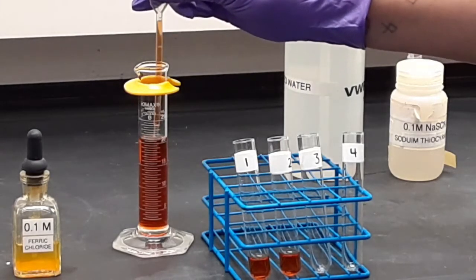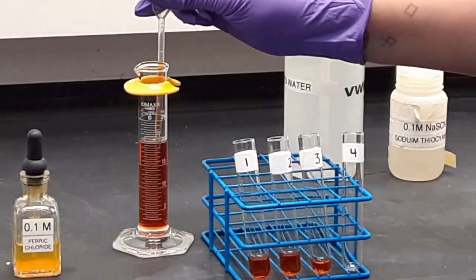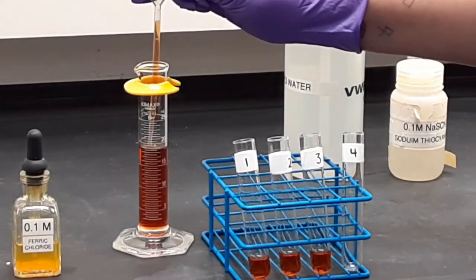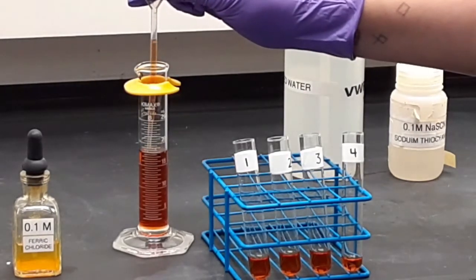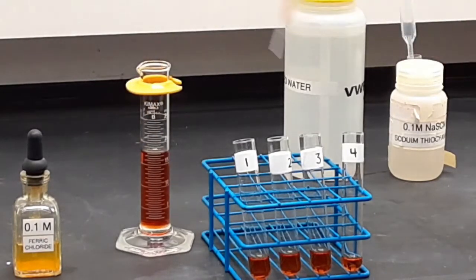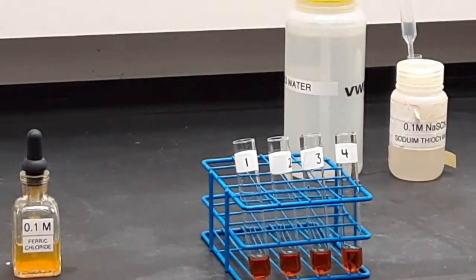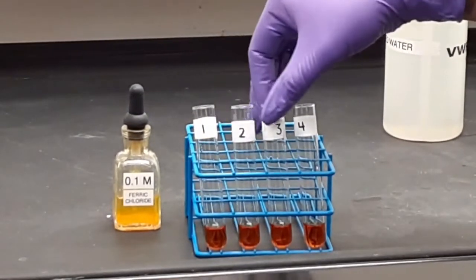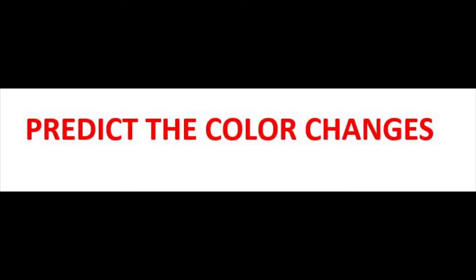You'll notice that Heather's using that as a guide. Predict those color changes now.